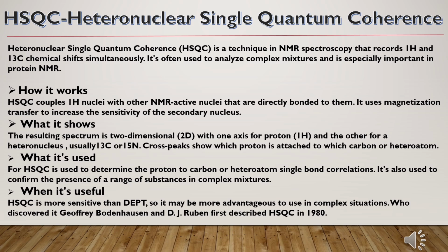When is it useful? HSQC is more sensitive than DEPT, so it may be more advantageous to use in complex situations. Who discovered it? Geoffrey Bodenhausen and D. J. Ruben first discovered the HSQC technique in 1980.